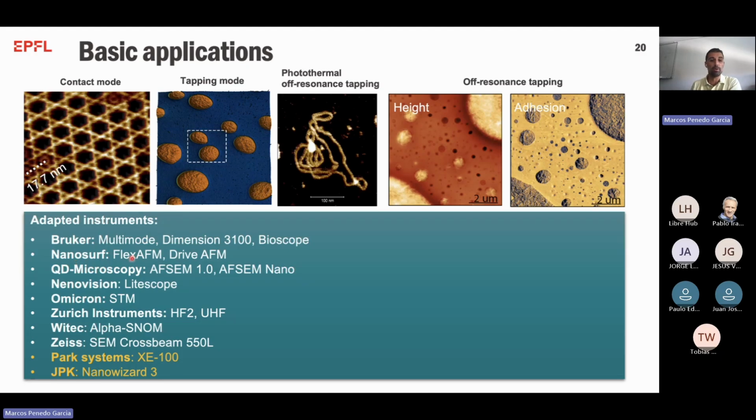So that's an example of how this open source is not restricted only to, let's say, the community that shares ideas at the university or other places. We can also collaborate with the industry. They licensed our controller and they sell it with their products, which also broadens the usage and scope of the controller.